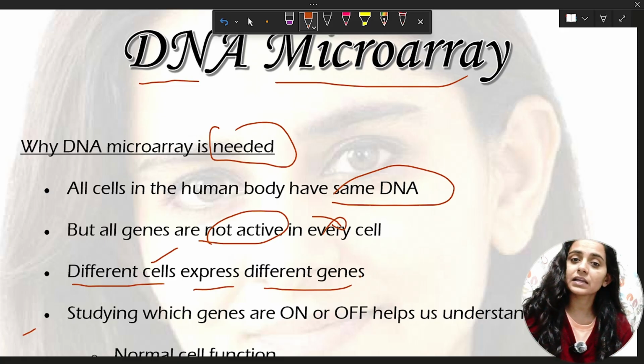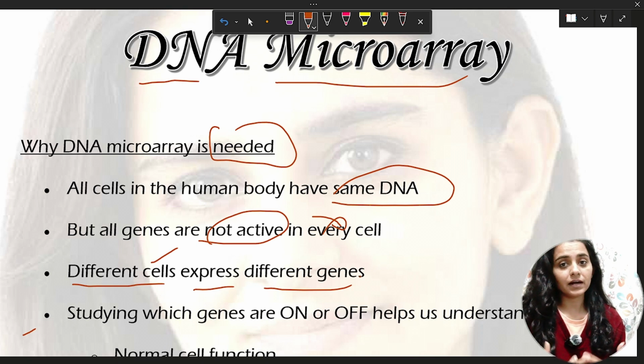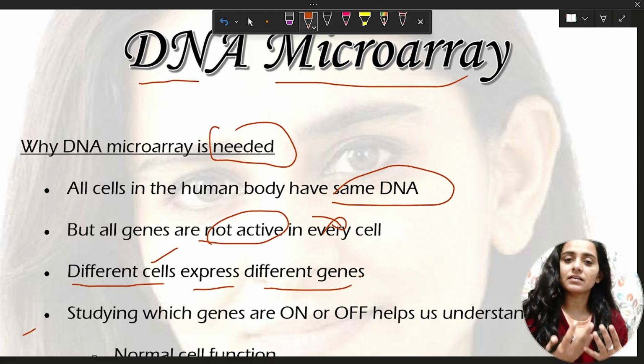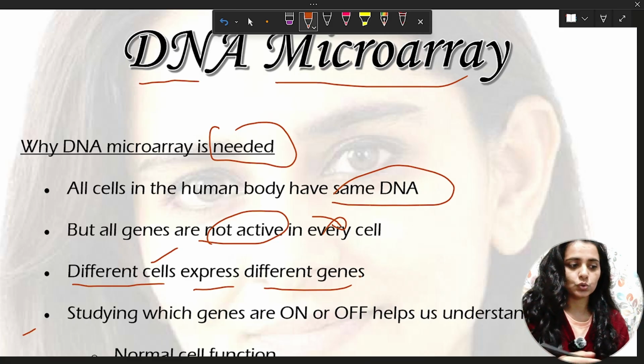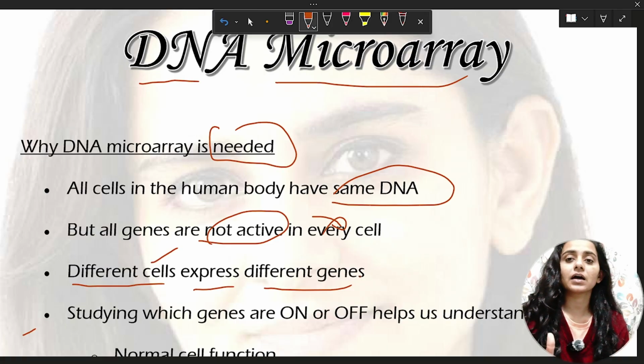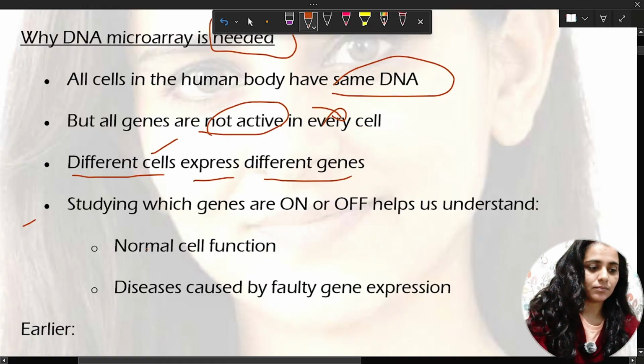It can be active, but their expression is very low. Or it can be active more highly than in the liver. So their activity differs from cell to cell, organ to organ, tissue to tissue. But all cells have all types of DNA, but expression can be on or off.